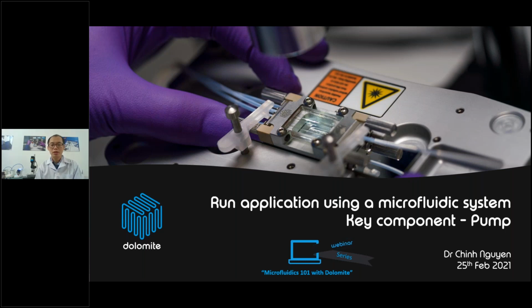So today, we will talk about the topic: the pump is a key component for running applications using a microfluidic system. This webinar is one of a webinar series we call Microfluidic 101 with Dolomite, which will be delivered on the last Thursday of each month throughout 2021.